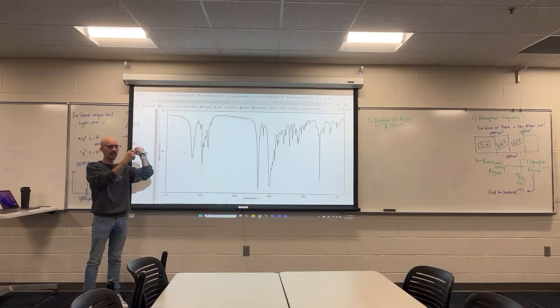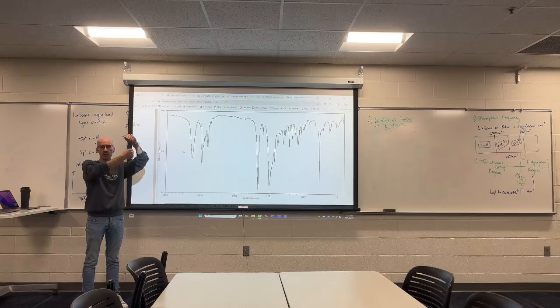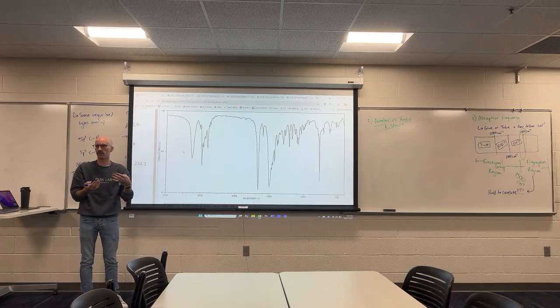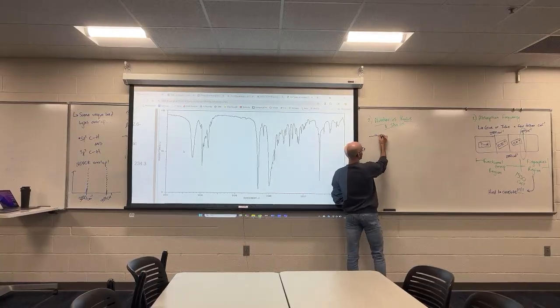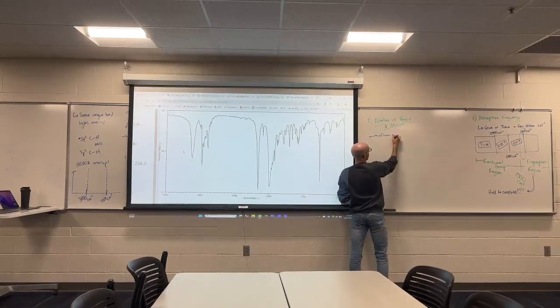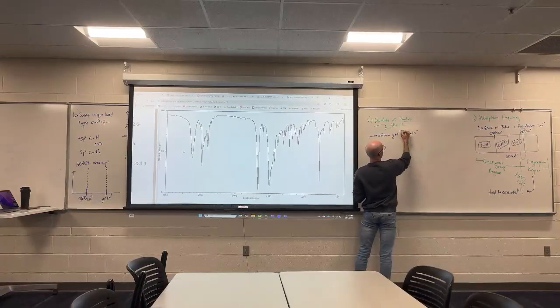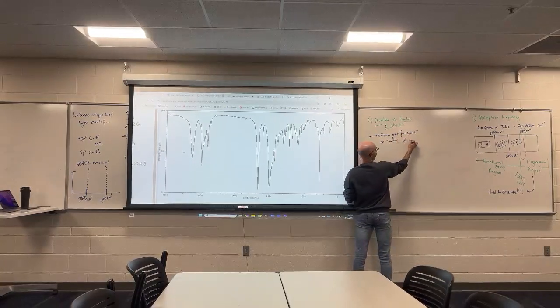So if one CH bond absorbs an energy and is now stretching, it's changed the nature of its bond, which can impact the nature of a neighboring bond to absorb a slightly different energy now as well. So we often get these packets or these sets of peaks.